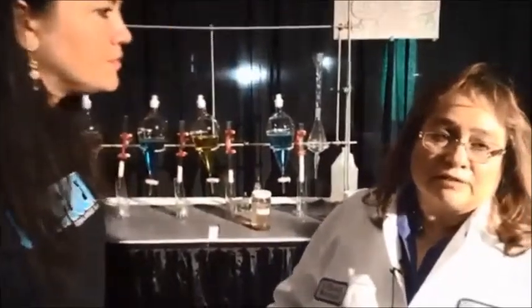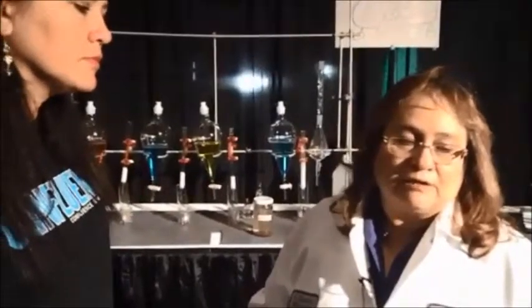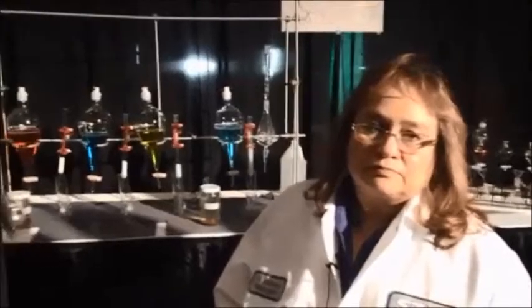How often does SAWS test water? We test it every day. There's many different tests going on. What we show here is just a very small example. At any one time, we could have maybe about 20 to 30 different tests going on in a day, maybe more. And we test the waters, both the water and the wastewater, every day, including the weekends and the holidays. So. Do we have any other questions coming through yet?